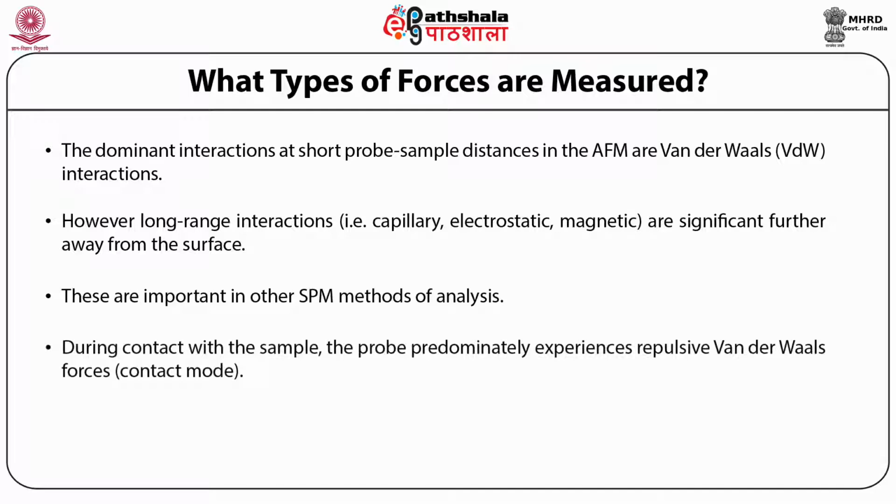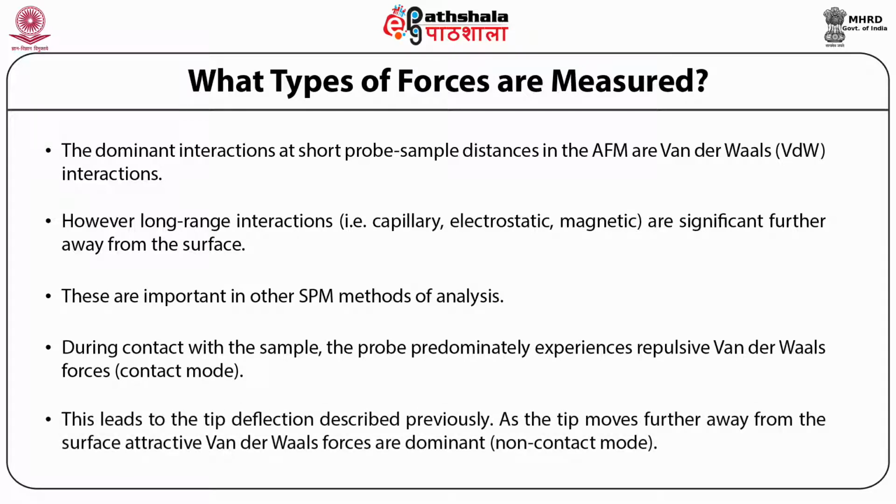During contact with the sample, the probe predominantly experiences repulsive van der Waals forces in contact mode. This leads to the tip deflection described previously. As the tip moves further away from the surface, attractive van der Waals forces are dominant in non-contact mode.